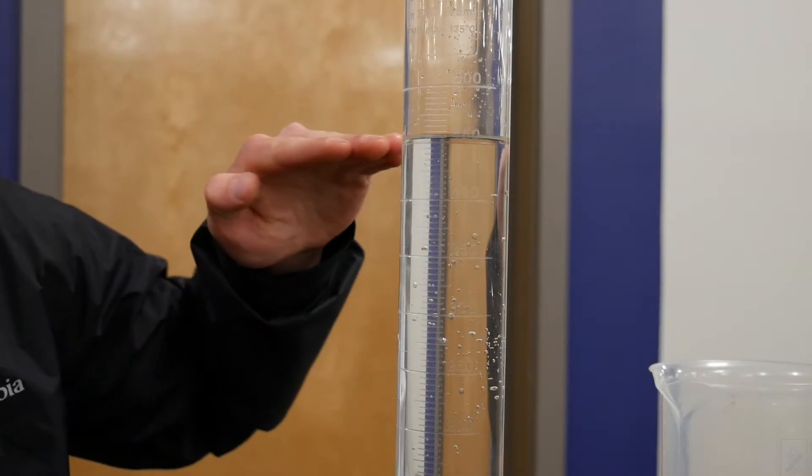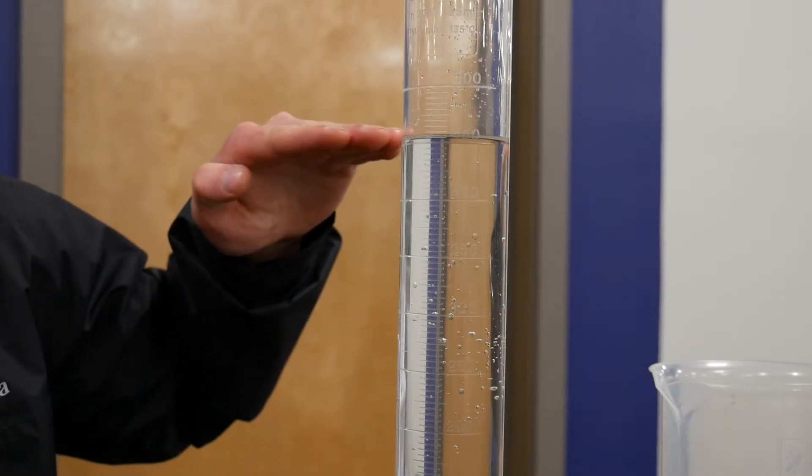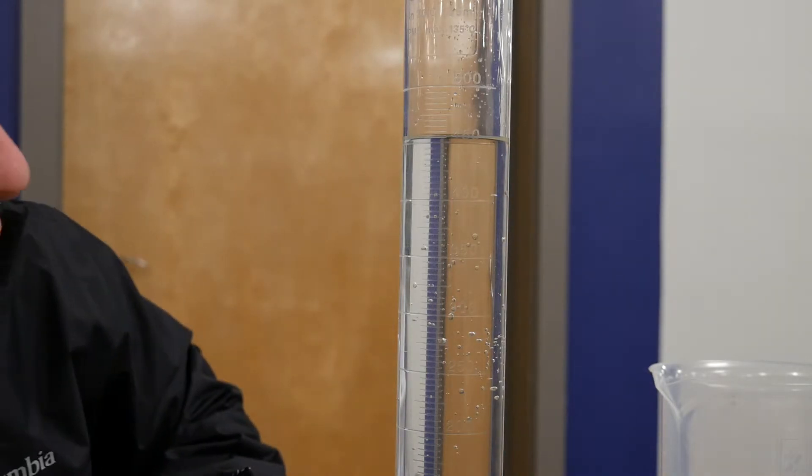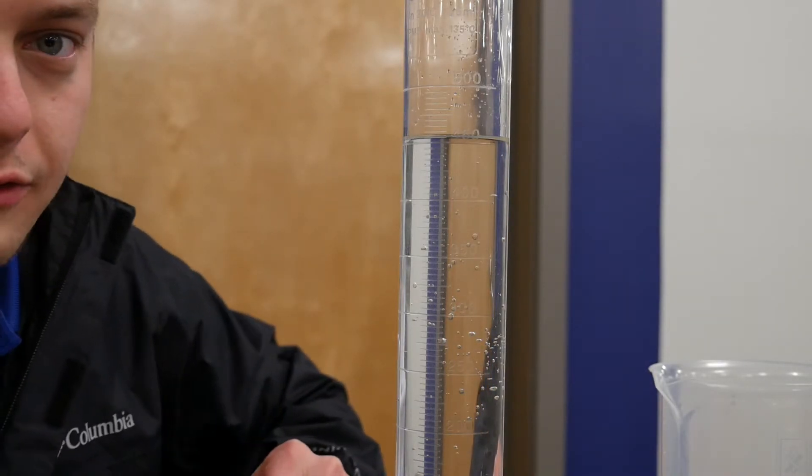So looking here at the middle of the water line, right at the top of the level of the water, we're going to look straight across at eye level and Parker's hand measured 455 milliliters.